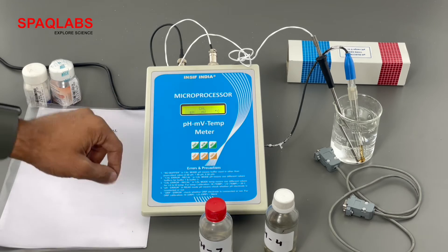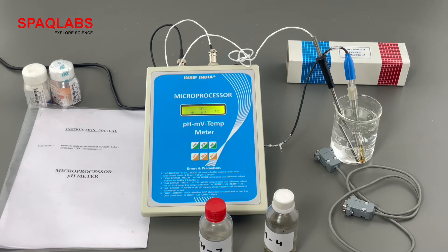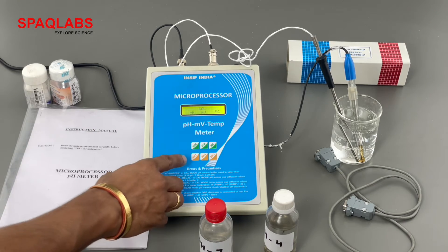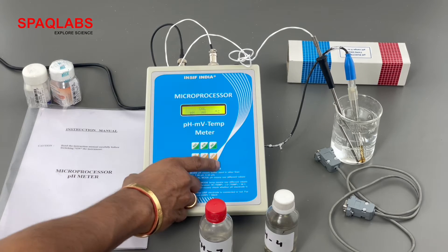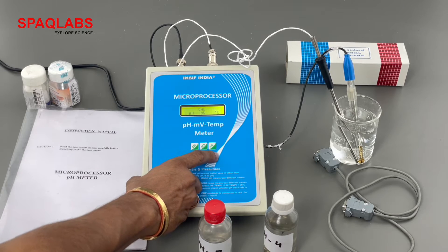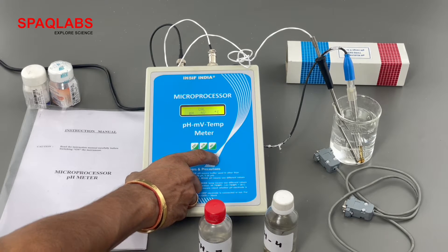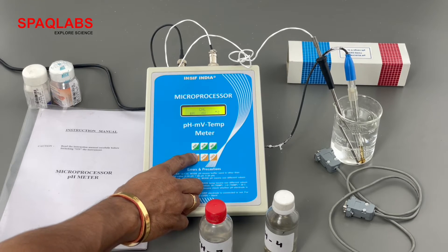Now in calibrate, we have three options: pH, MV, and temperature. For pH calibration, press enter. The cursor is below pH; you can change it using increase and decrease. We are going to calibrate the pH, as the other two are already calibrated. Press enter.